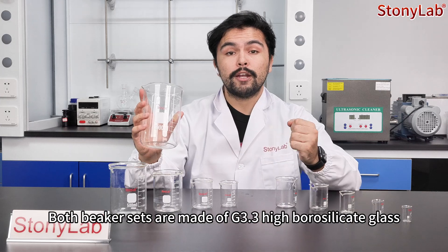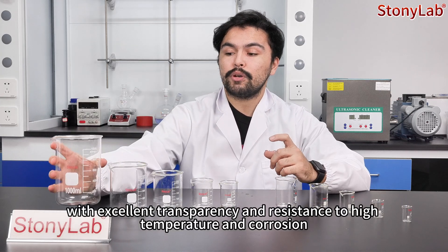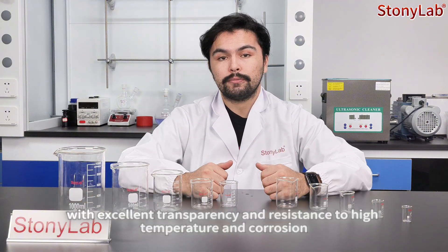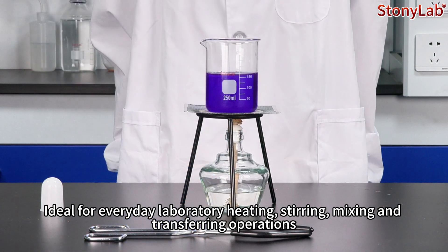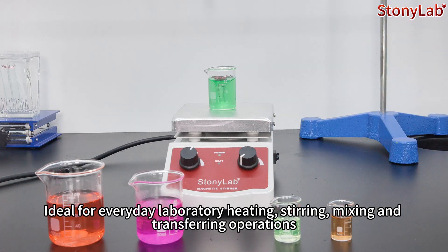Both beaker sets are made of G3.3 high-borosilicate glass with excellent transparency and resistance to high temperature and corrosion. Ideal for everyday laboratory heating, stirring, mixing, and transferring operations.